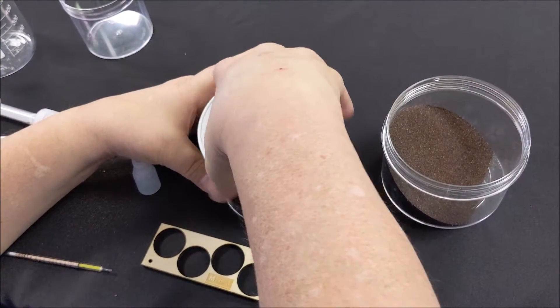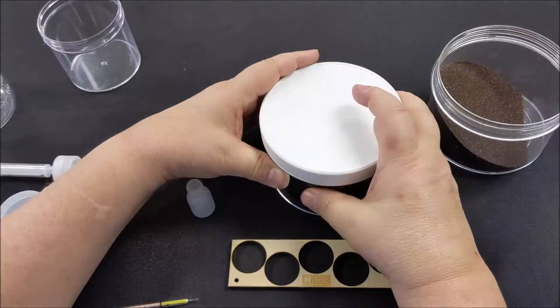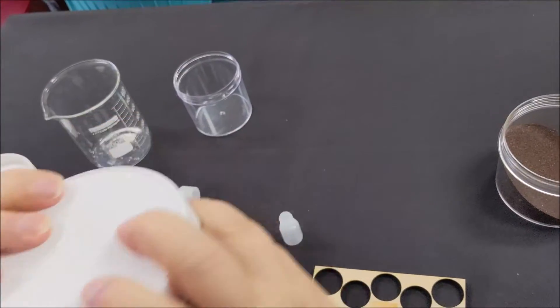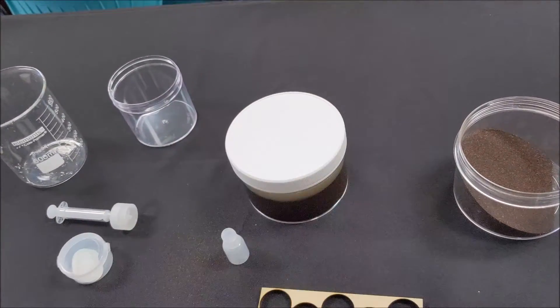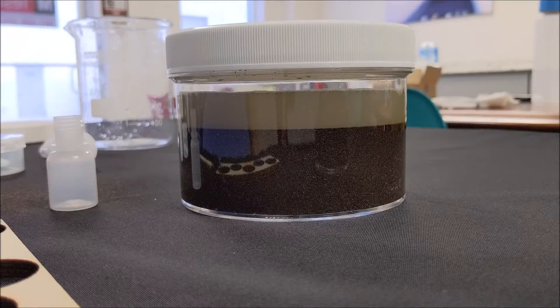Put the lid on tight and shake to mix the water with abrasive. Let sit for a minute and repeat. Now let it sit for 8 minutes. The thick layer of water on top is called the supernatant liquid.